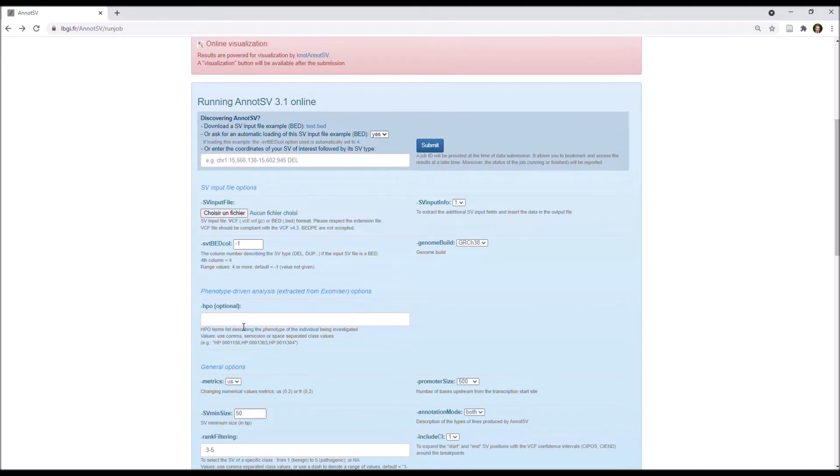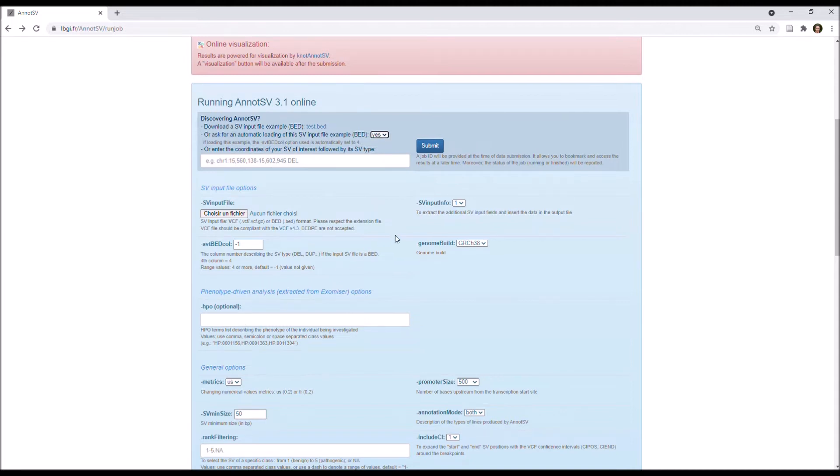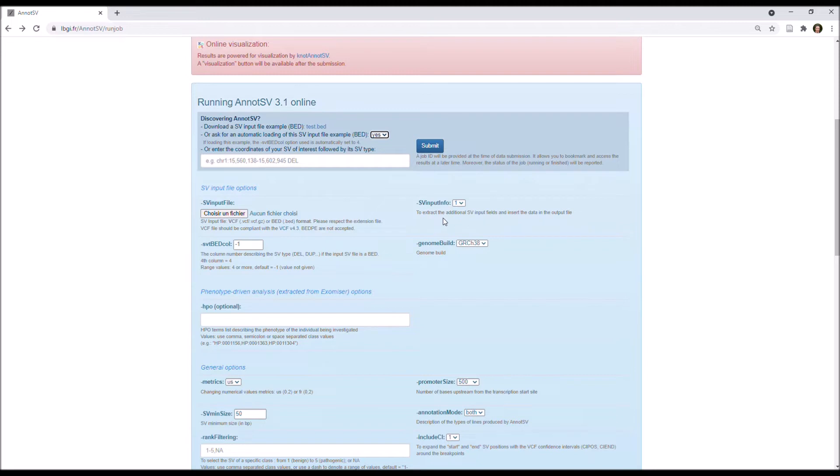Basically, the other default options are quite good for analysis, but let's have a look at them anyway. By default, AnnotSV extracts and integrates all of the additional data from the input file, and you can choose not to report them by setting this option to 0.